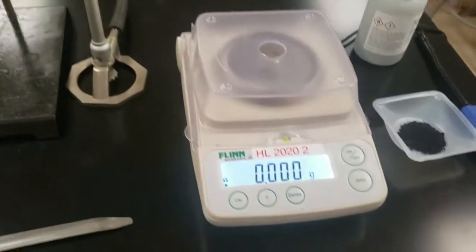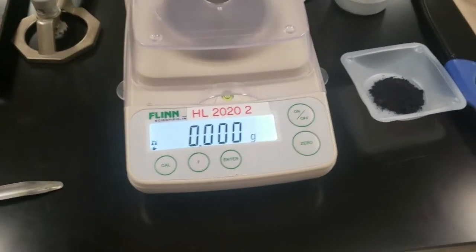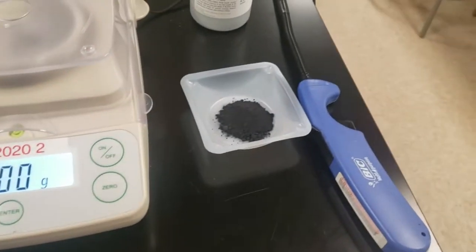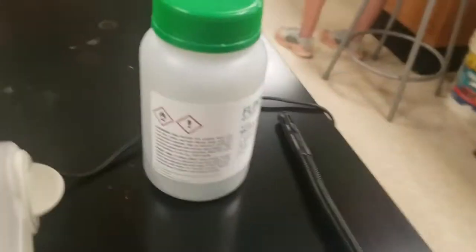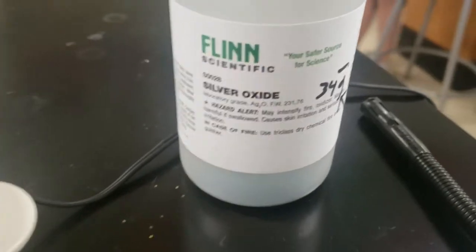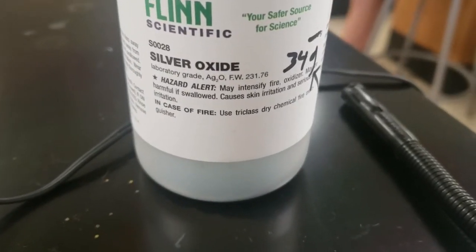You'll need a scale that measures to the thousandth of a gram or a milligram scale. This black stuff is silver oxide. Don't forget to read the hazards on it. It's slightly expensive, so don't waste it.